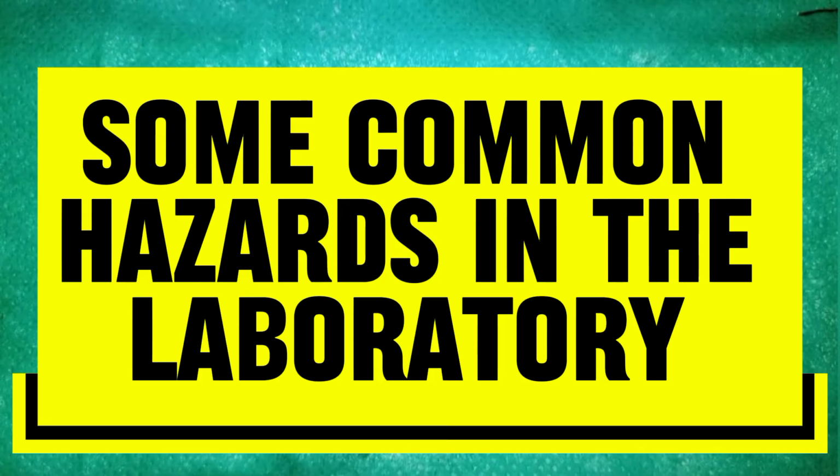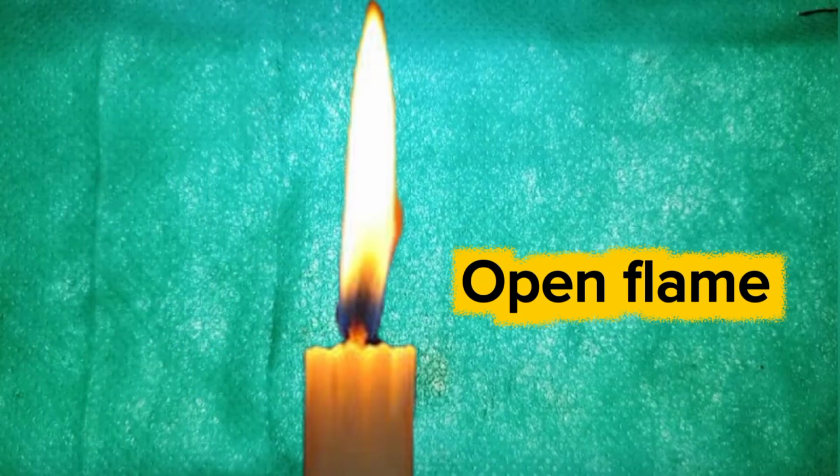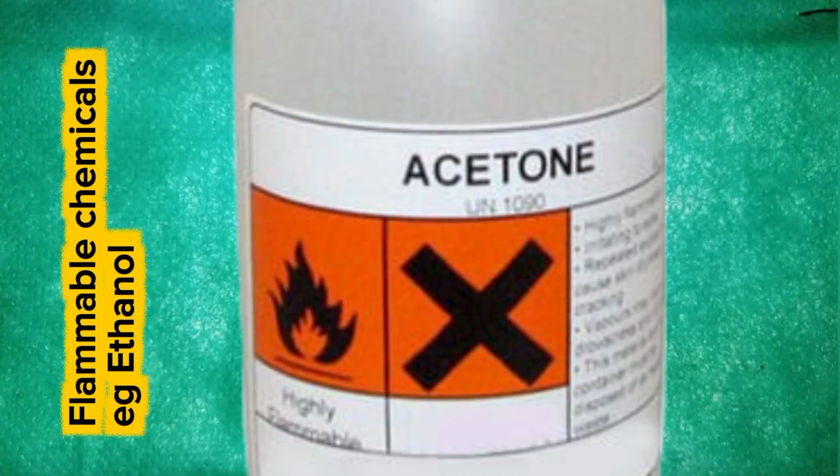Some common hazards in the laboratory are, remember, a hazard is a situation that can cause accidents. We have open flames, open electrical sockets, broken glass equipment, and flammable chemicals like ethanol, petrol, spirits and so on.